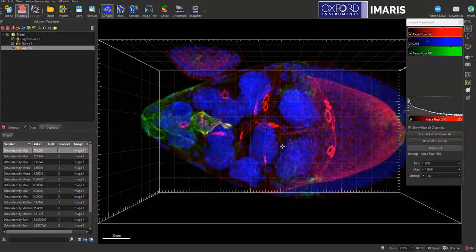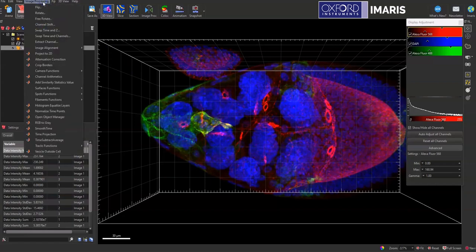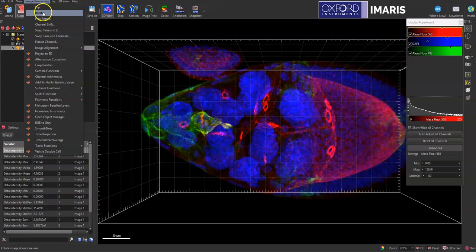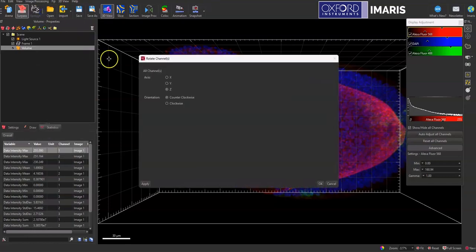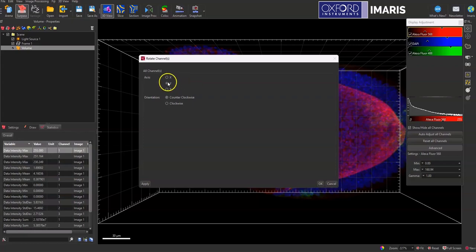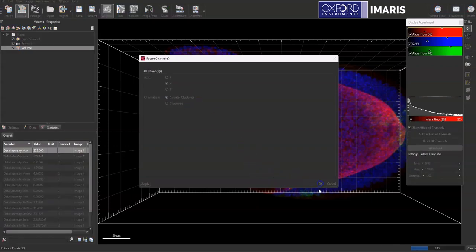And so to do that I'll go to image processing and select rotate. And so this is going to be dependent upon what kind of rotation you need to do, but for this data set I'm going to do a y-axis counterclockwise rotation.